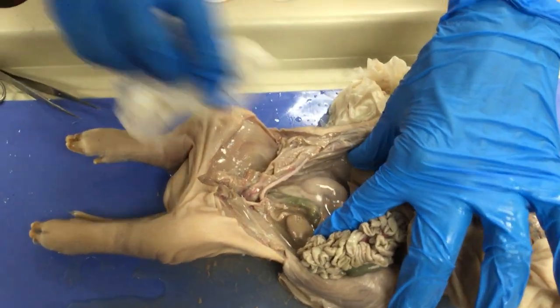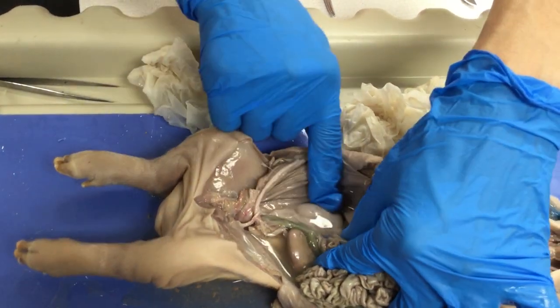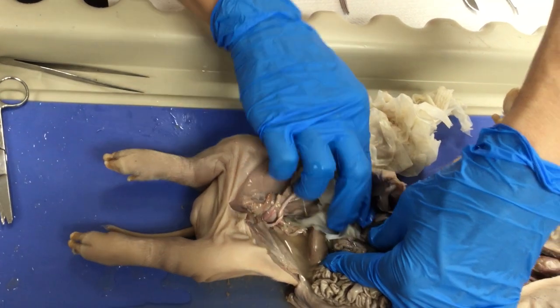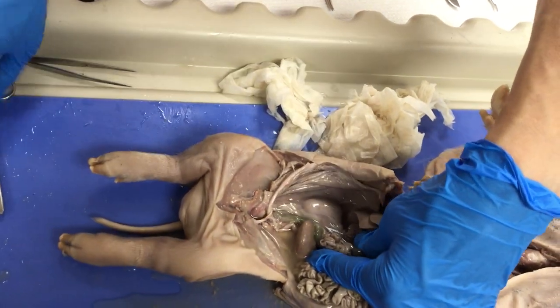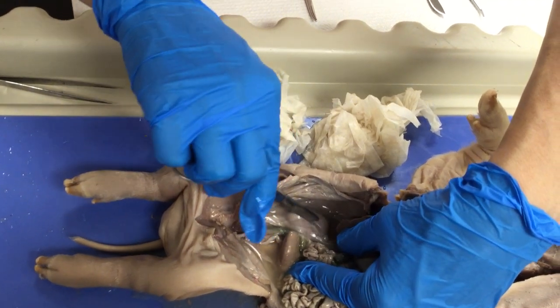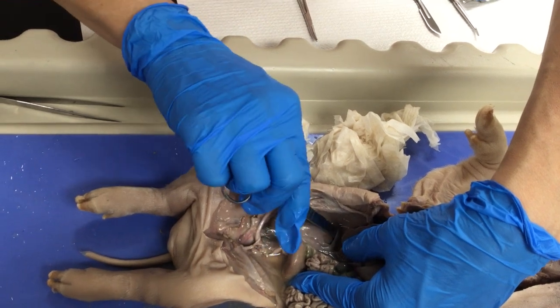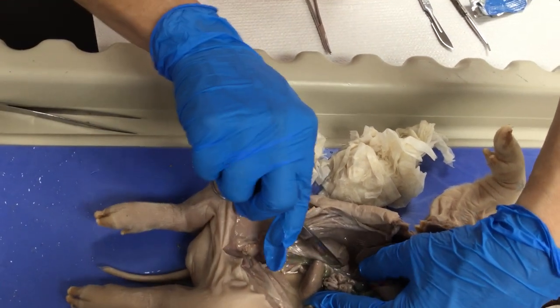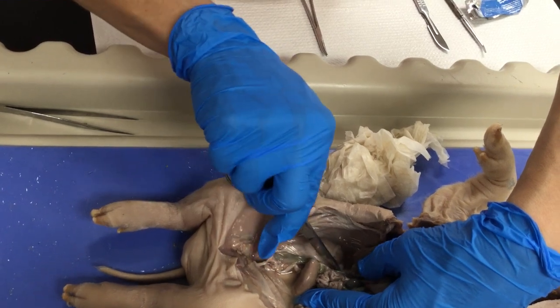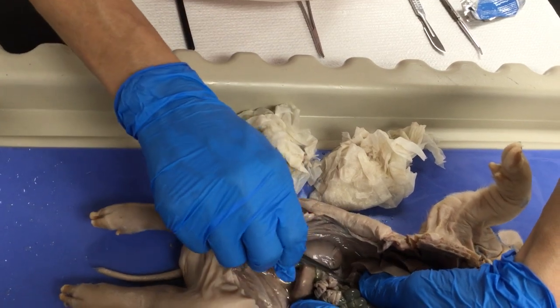Here is the right kidney with its peritoneal covering, and you can see better in the superior pole the adrenal gland.